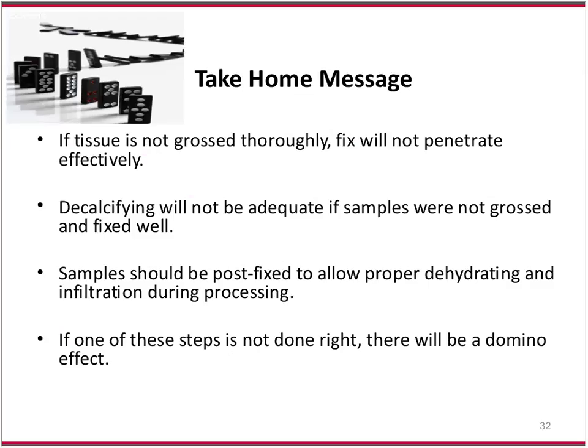So you can see I have a picture of those lovely dominoes on this slide. If tissue isn't grossed well, if the ends of the bone aren't cut off, the fix won't penetrate.